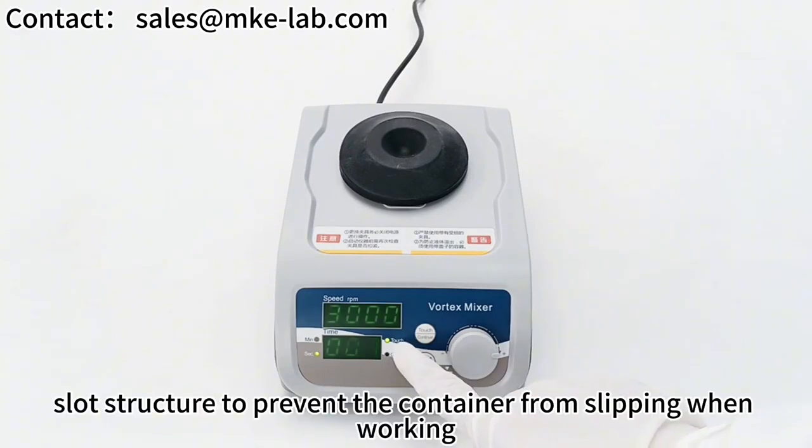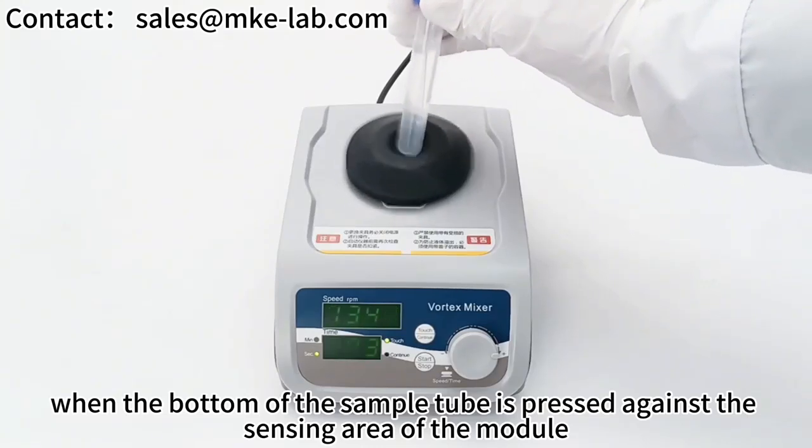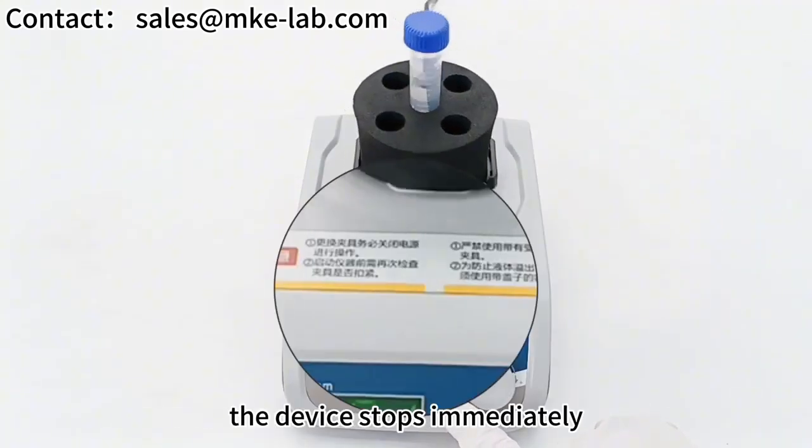The K10-1 module adopts a slot structure to prevent the container from slipping when working. When the bottom of the sample tube is pressed against the sensing area of the module, the device will automatically run in positive timing. After mixing and removing the sample tube, the device stops immediately.